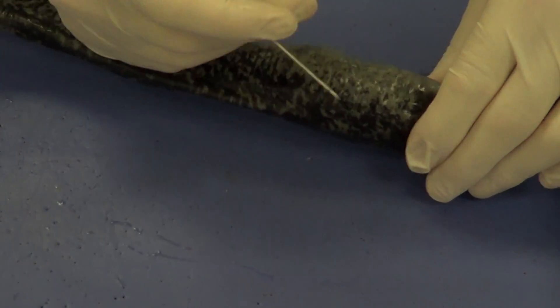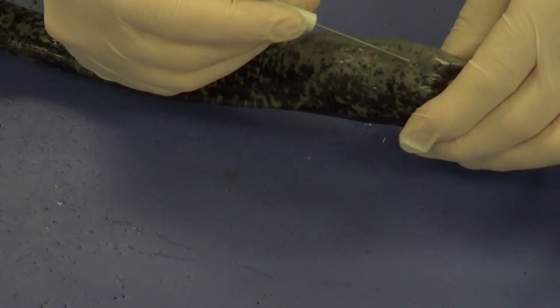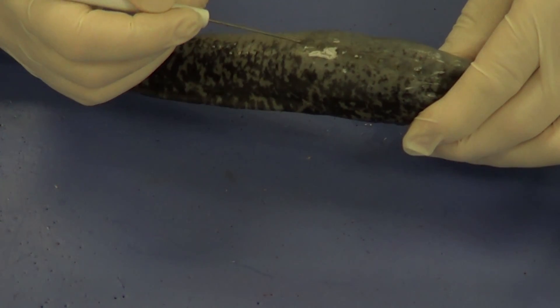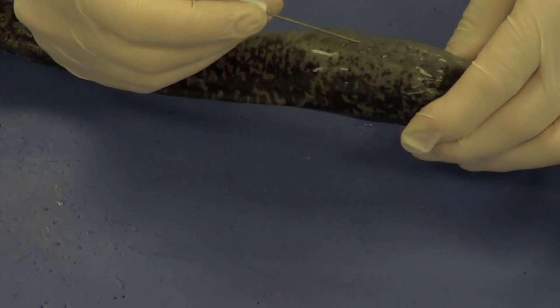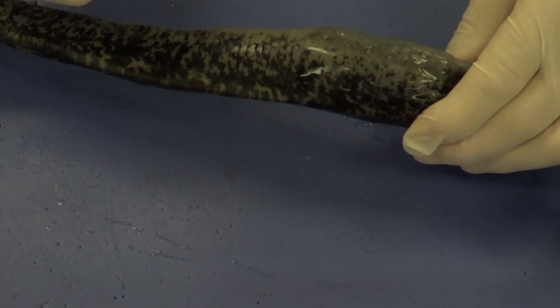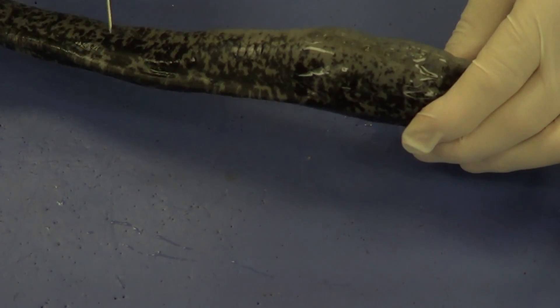If we come over to the side, we can see various openings — one, two, three, four, five, six, seven. Seven openings, and you can see I can actually put my probe in there. These are external gill slits, and that is where the water actually enters the lamprey for oxygenation.